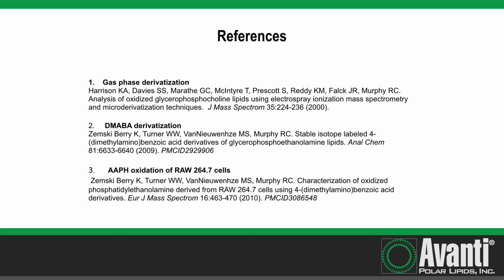So here's some references to using this strategy. It's sort of a very esoteric strategy, but one which is available from Avanti, those deuterium-labeled reagents. And if you're interested in phosphatidylethanolamine or phosphatidylserine biochemistry, they can be tools which allow you to investigate unique biochemical events taking place with these aminophospholipids.